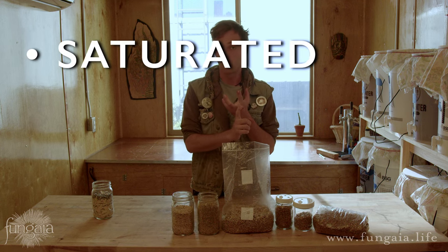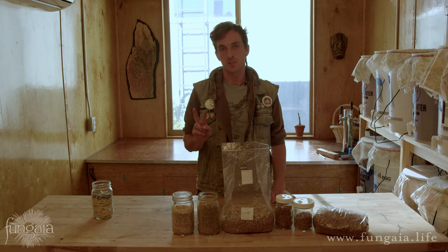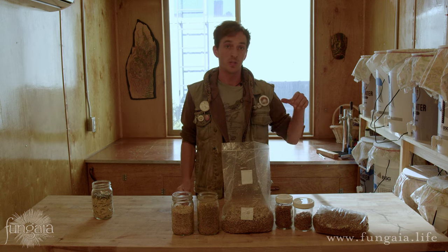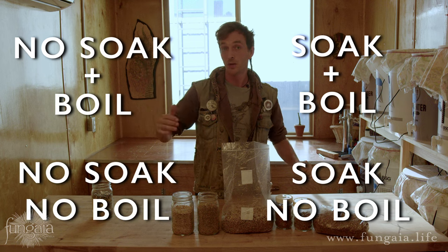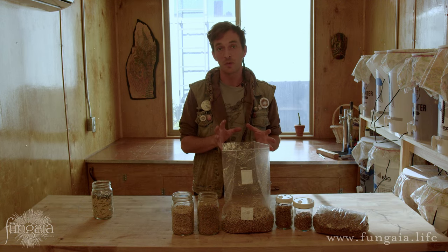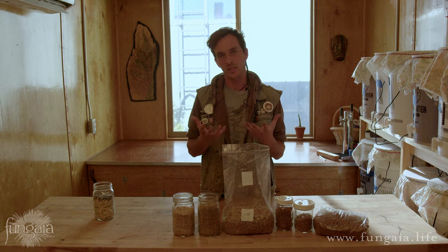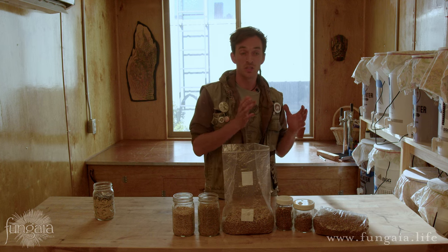So our three things: we want saturated grain, dry grain, and intact grain. There are two basic parts to this process and neither is totally necessary: there's the soak and there's the boil. That means you can do a soak with no boil, a soak and boil, a no-soak boil, or a no-soak no-boil. What I'm going to show you is both soaking and boiling. When you're soaking the grain you're gradually increasing its moisture content; when you're boiling the grain you're rapidly increasing its moisture content.